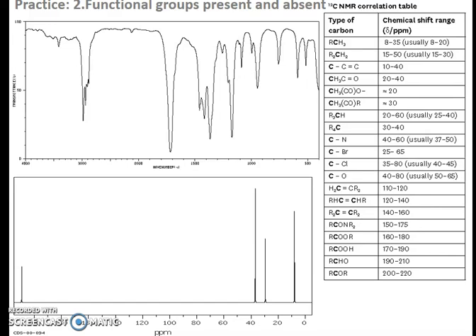There's not really much else present in either of those spectra. There's four peaks in the NMR, so that would indicate perhaps four carbons. They're all roughly the same size. So I would be inclined to think this was most likely butanone.